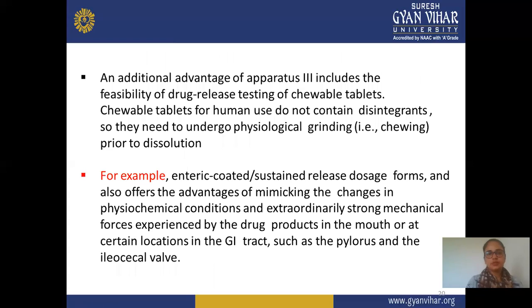And this is regarding type 3. Additional advantages of type 3 include feasibility of drug release testing of a chewable tablet. Chewable tablets for human use do not contain disintegrant, so they need to undergo physical grinding, that is chewing, prior to dissolution. Means you can also use this type 3 apparatus for chewable tablets. With the help of this type 3, you get proper results for chewable tablets.